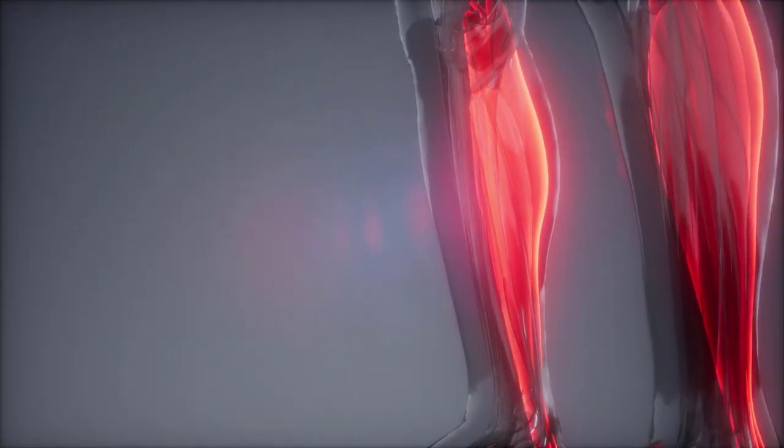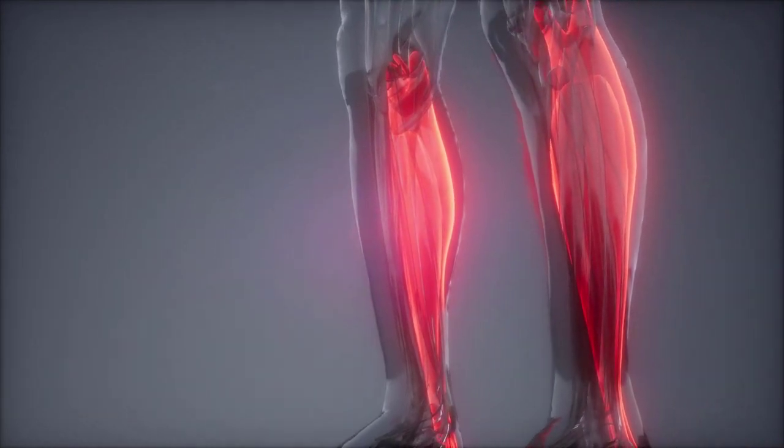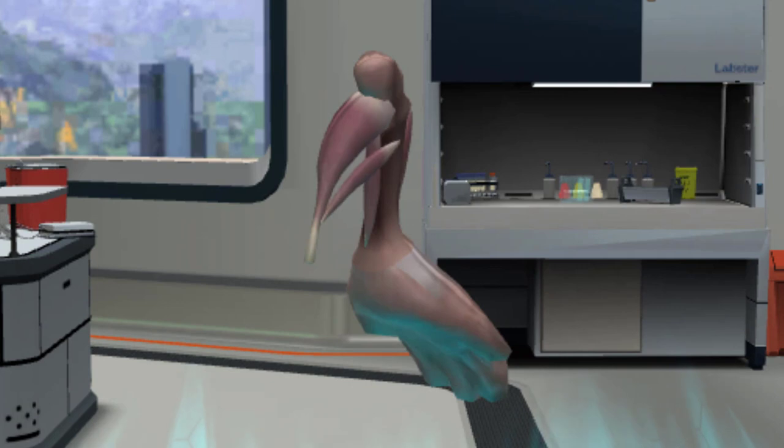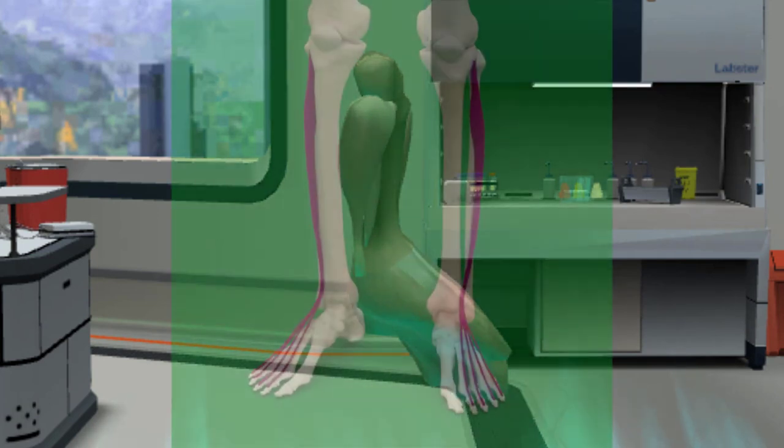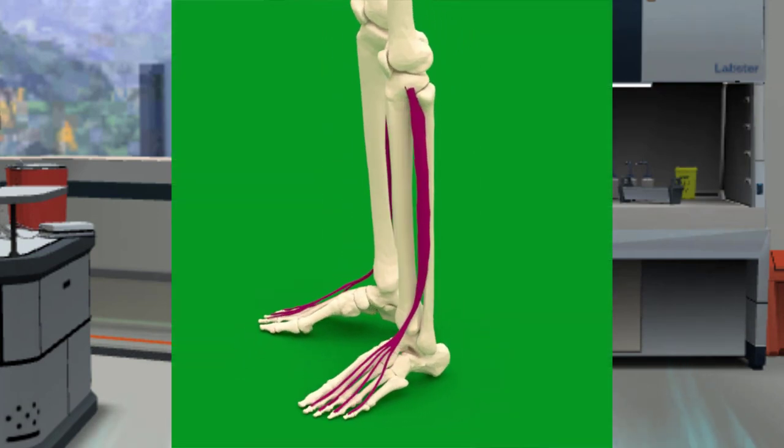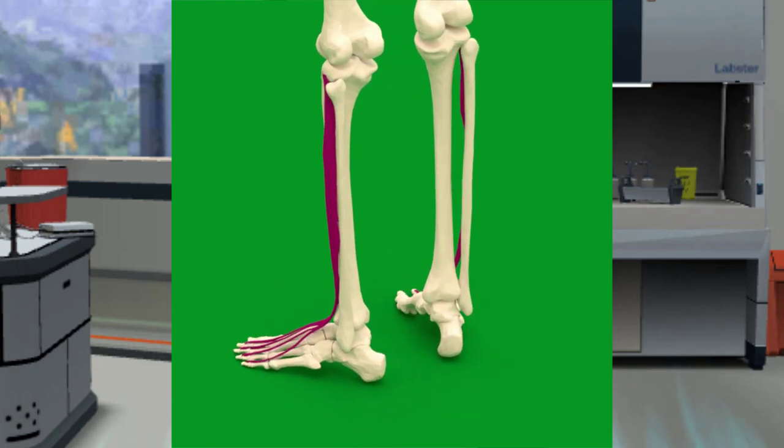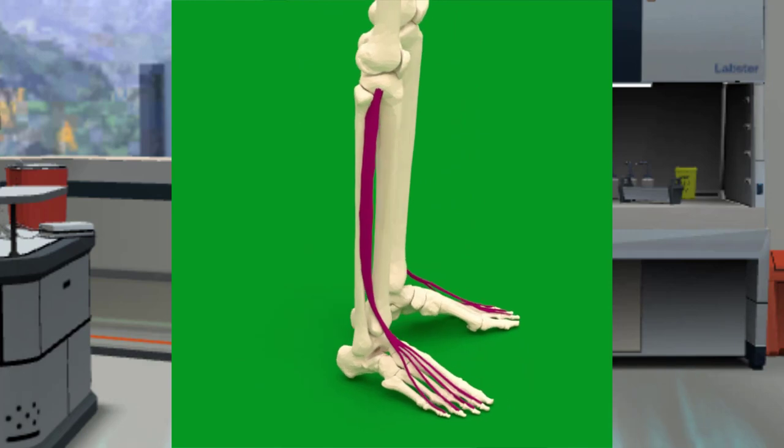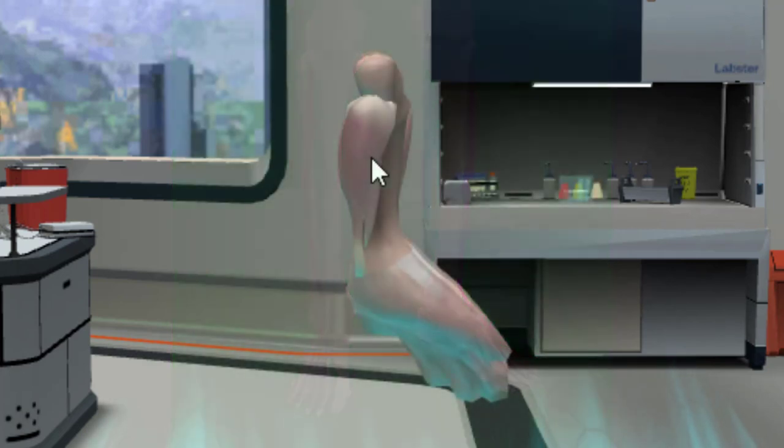First, you'll dissect the soleus, a muscle located at the back of the leg, and part of the commonly called calf muscle. You use the soleus for maintaining posture. Click on the rat leg to remove the soleus muscle. The other muscle is called the EDL, or extensor digitorum longus, and is located at the front of the leg. This is a common muscle to study because of its ideal geometry. Click on the leg to dissect out the EDL.